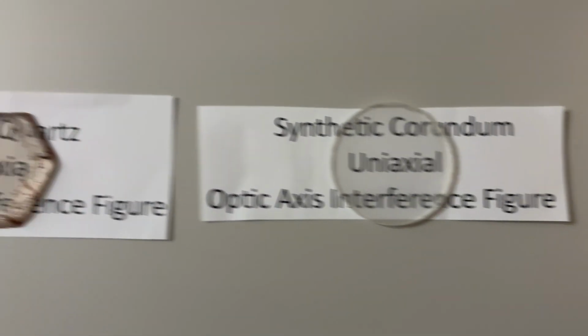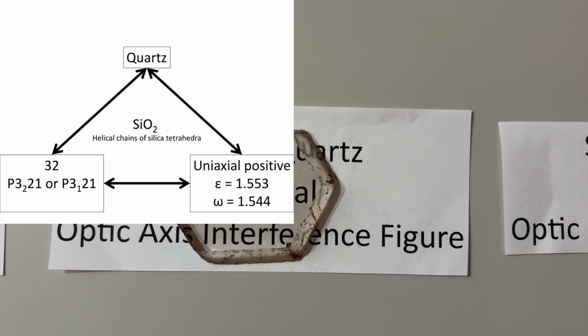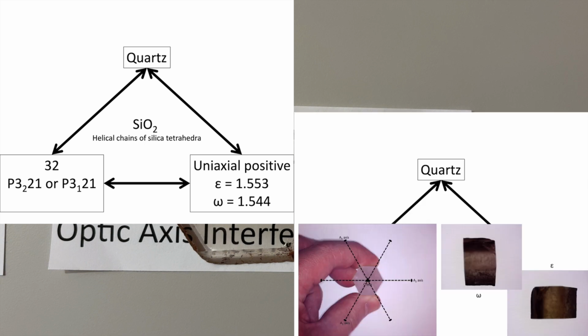Next up in our samples for today is our natural quartz slice. There's another educational video detailing quartz slices, and that is Snellius Minerals LLC quartz slice. And once again, we have some summary figures here that detail the relationships between our chemistry, structure, symmetry, and optics of our quartz.